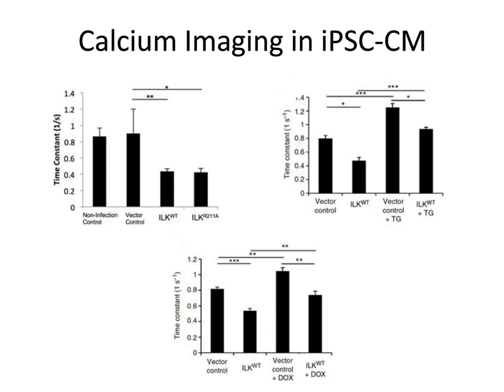So addition of doxorubicin to control cells profoundly increased the time constant. And so that means that calcium is not being recycled nearly fast enough and the cardiac contractility is compromised. By adding or overexpressing integrin-linked kinase in those cells, we were able to improve the time constant back to normal, showing that we improved and corrected for the doxorubicin-induced changes in calcium cycling within the cell.